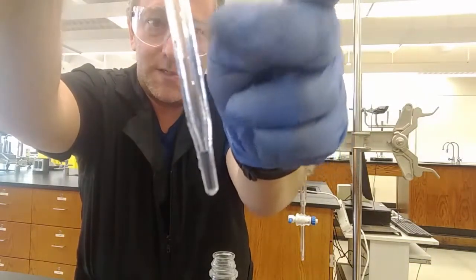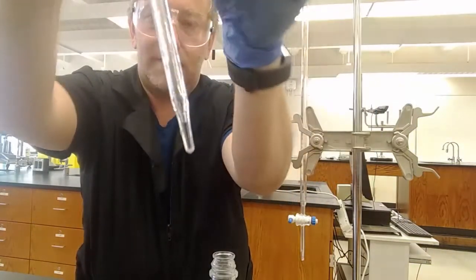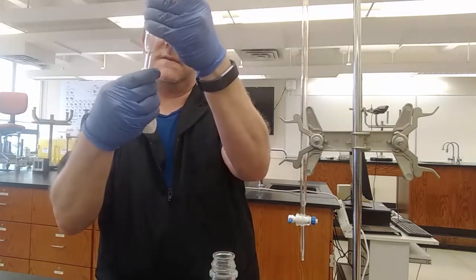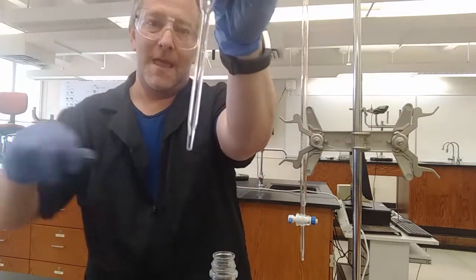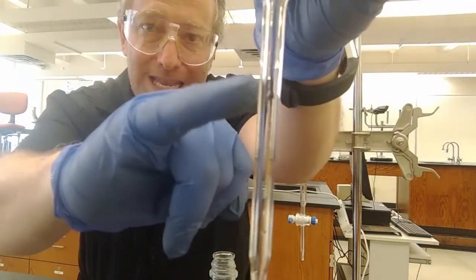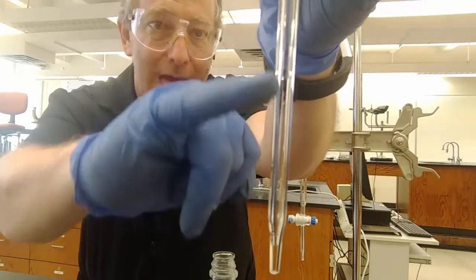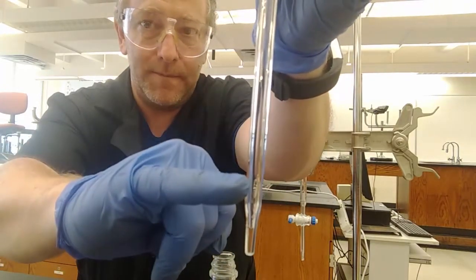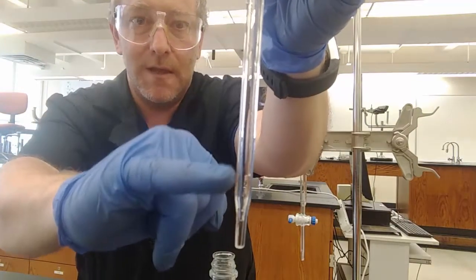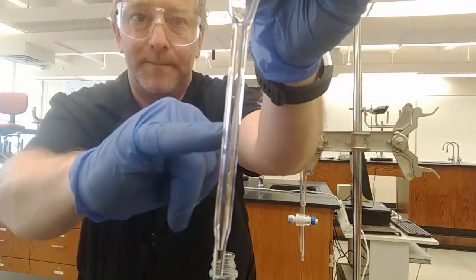Now, there's a drop on the outside from where I had it in the vinegar. Just clean that off with a paper towel to see if there's anything on the inside. And in fact, there is, okay? There's drops of vinegar inside the pipette. That is not supposed to happen. It has not delivered 10.00 milliliters. This pipette needs to be thrown away.